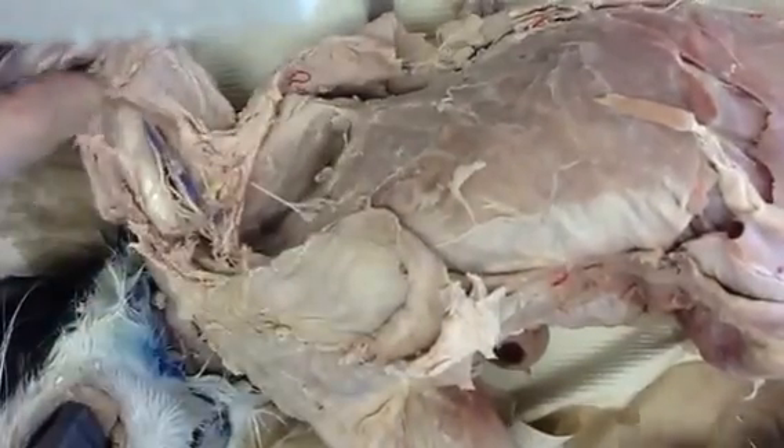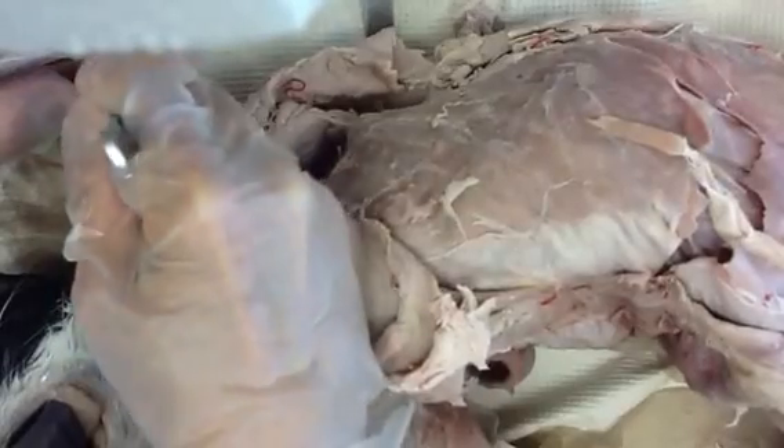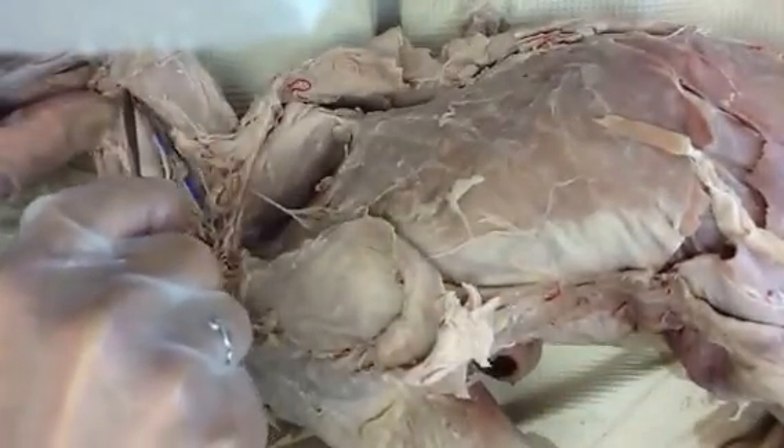Eventually the radial, the ulnar, and the median nerves should all come out of this bundle. What we want to try and do is follow it — it's kind of like following a river route until we find a destination where the tributaries all separate off.